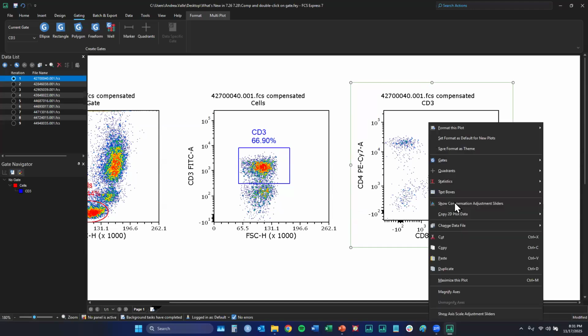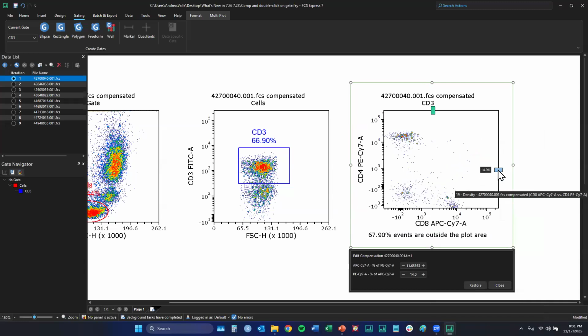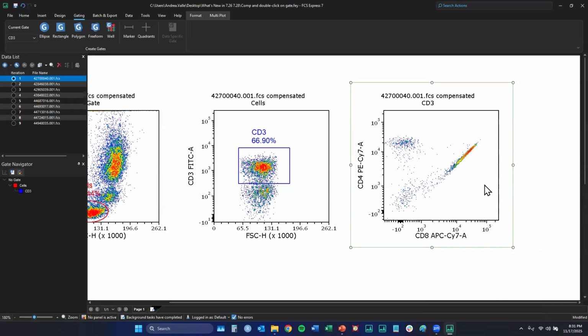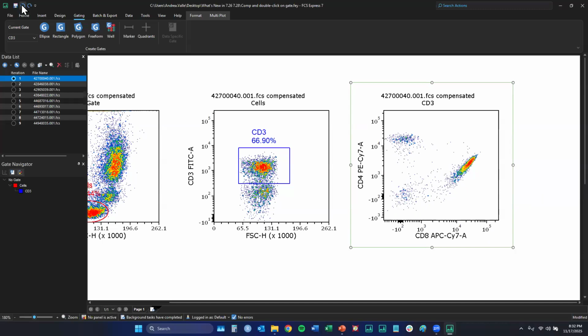So if you want to go back and do other changes, restore will restore to the previous state, which is this one. So it's always one step back. If you want to go really back, then remember that you have undo. So I can undo, and click, and you see I'm still undoing. So undo is really powerful in this regard.